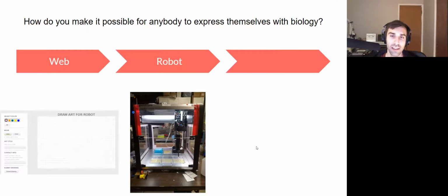For the colors, are they all visual colors or some of them UV? What are the reporter systems? Are they just color? Yeah, mostly chromophore proteins. So they're proteins that you can see with the human eye. GFP is one of them, green fluorescent protein. And that one you can see without a black light, but it looks way cooler with the black light because it glows. And you can see that in some of our photos that we've taken.